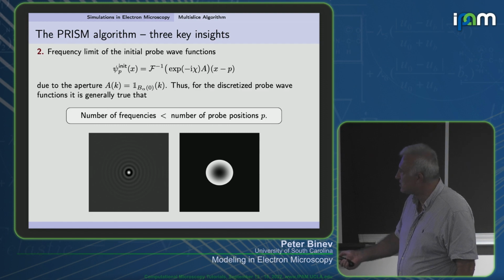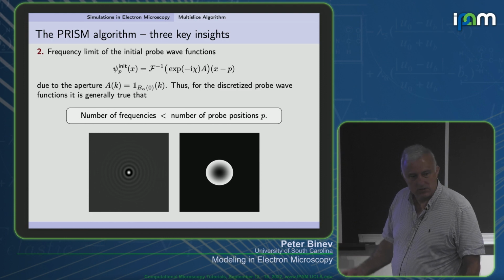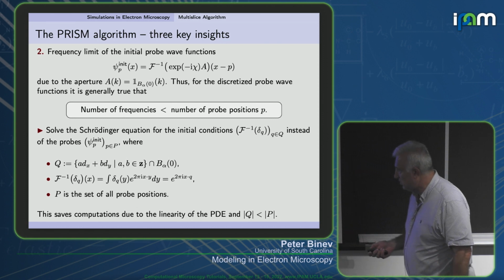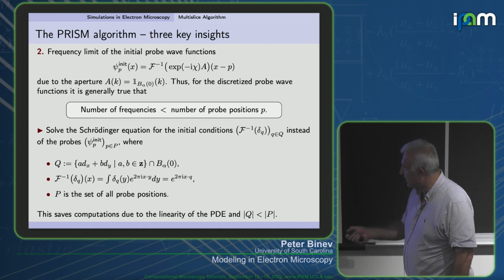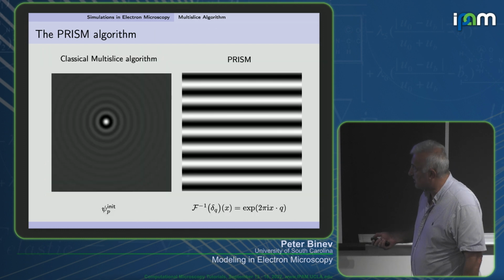So these 30,000 functions, we can calculate what is happening to them, and then eventually calculate what is happening for this particular probe or any probe position everywhere else, because that would still be a linear combination of the same functions. So that is what we are doing, and then we have the set of the positions and the set of these elementary functions. We have this inequality between their sizes, which is kind of essential.